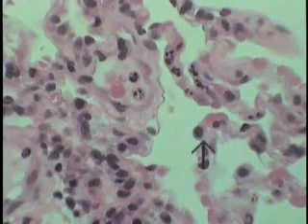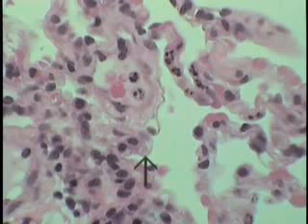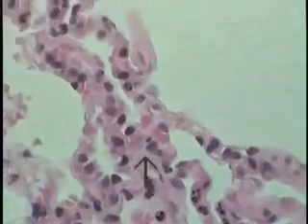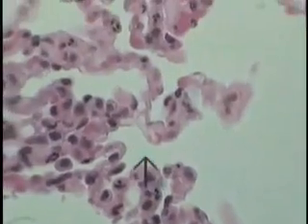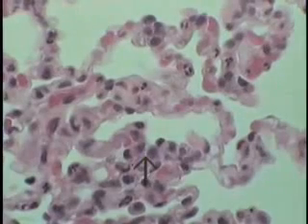If one goes a little bit over on this side, here again is that little thin blood-air barrier made up of the endothelial and type 1 pneumocyte with an intervening basement membranes and connective tissue. So on the plastic type of material, these critical cell types, the type 1 and type 2 pneumocyte, can indeed be observed with careful observation.